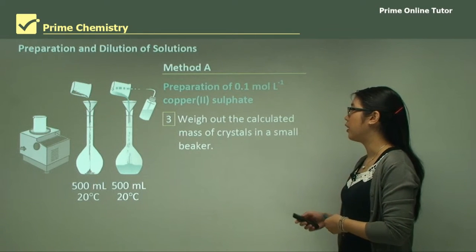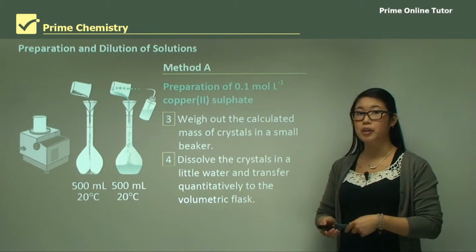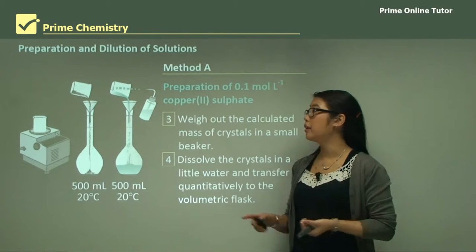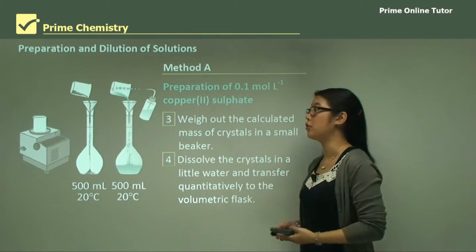Next we need to weigh out the crystals in a small beaker, then dissolve them in a little water, and then quantitatively transfer it to the volumetric flask. What's really important is that we first dissolve a little bit, pour it in, and then rinse it out to make sure we get all the copper sulfate out of the beaker.